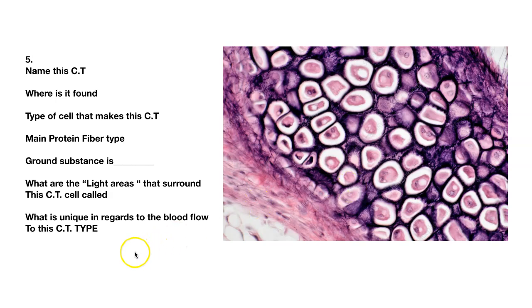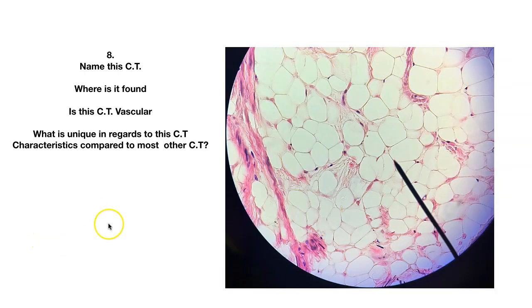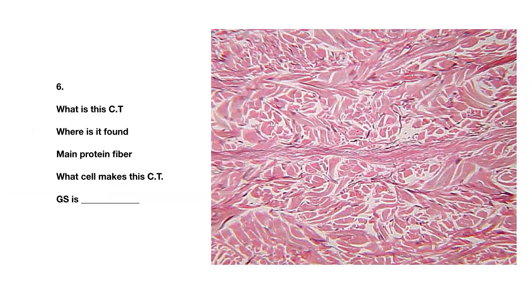So that was number 5. Here is, oops, skip number 6. Here's number 6. What is this connective tissue called? Try to give me at least 2 places where you can find this particular connective tissue type.